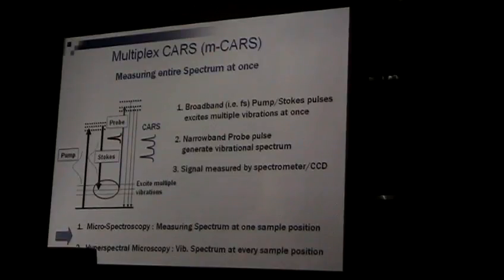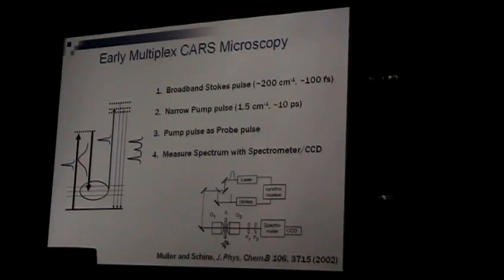All right. So in this case, okay, people began to work on this project in like 2002, and the earlier version is like this. Generating different pulses with synchronization is tough. So what they did was, okay, they have two types of laser actually here. One running in picosecond mode, the other running in femtosecond mode, and they just synchronize them electrically.